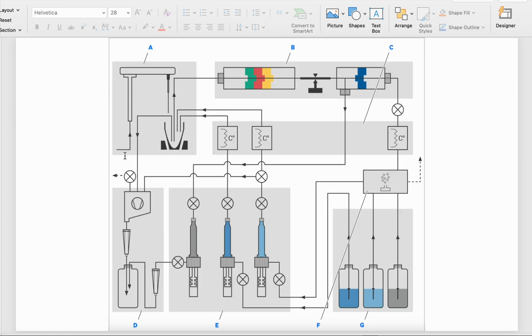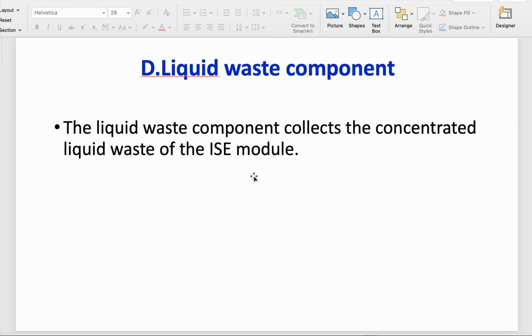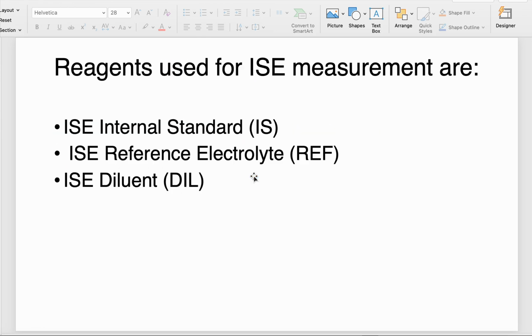Okay, what that means is, this one is drawn from here, going through the syringe and through here, and will go through here, while this one is going through here. And then the voltage is measured and the computer displays it. Keep in mind that that's the standard.